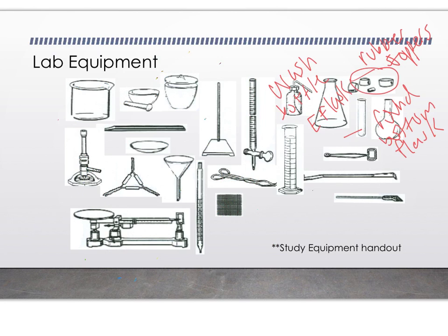This picture right here, this is your test tube, in which your test tube tongs can transfer the test tube from one location to the next. But a test tube is used for many different reasons. It can be heated, but it still holds different small amounts of your liquids, and it can also be used for a small scale reaction to see what would happen before you move up to a large scale.